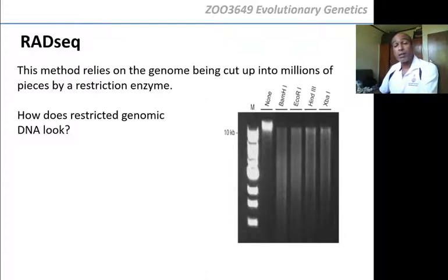Now look at this. These 4 lanes here are this DNA put into 4 other tubes, and in each tube it was restricted by a different restriction enzyme. Here's HindIII, XbaI, EcoRI, BamHI. Okay, these are known restriction enzymes. What has this BamHI done to this DNA? It doesn't look the same anymore. Yes, there are some big pieces remaining, but most of the pieces are here.